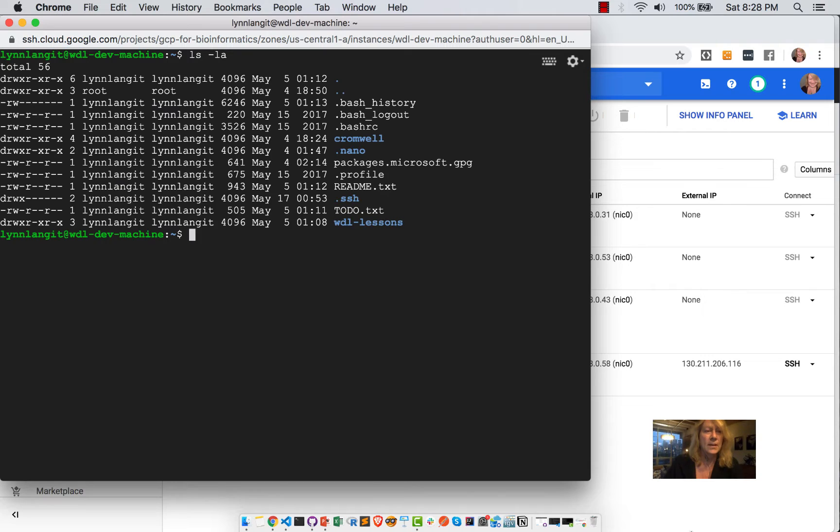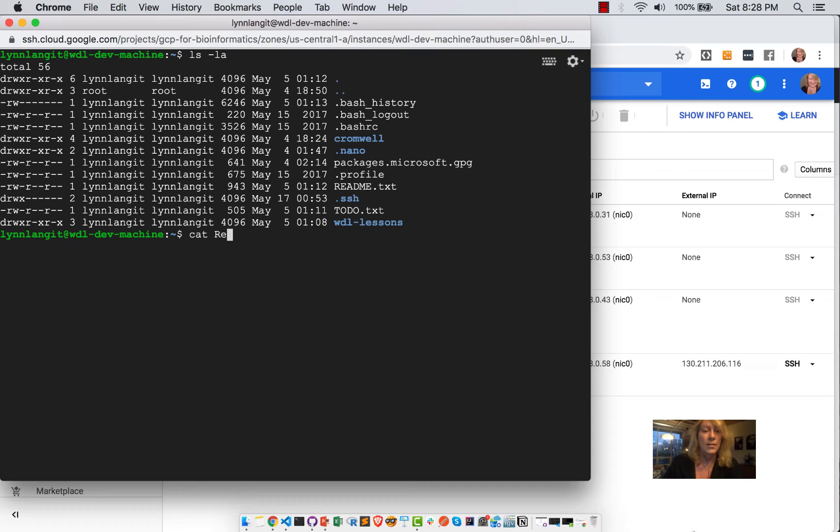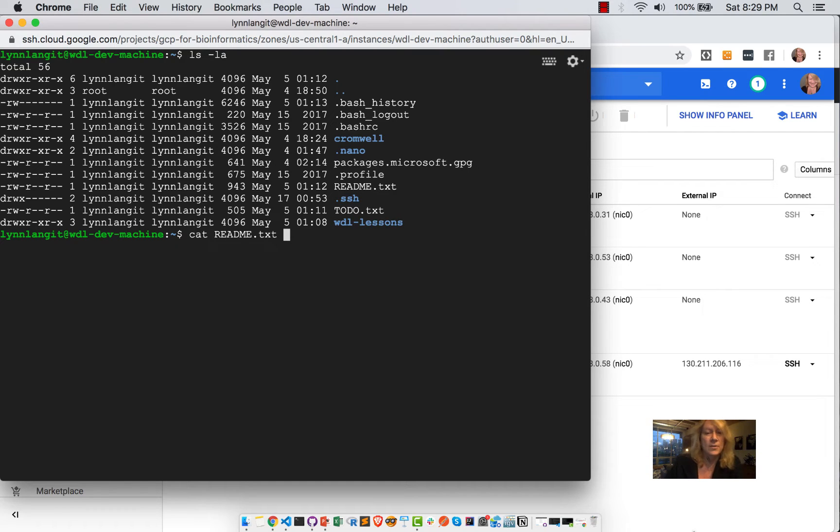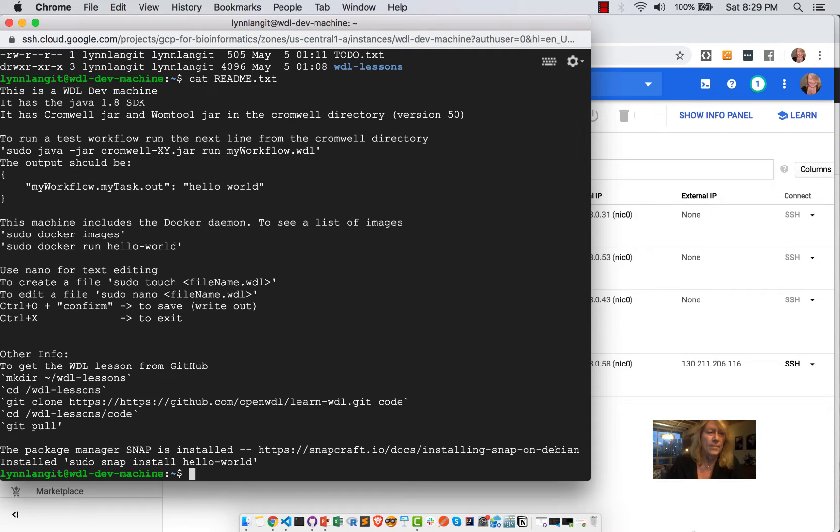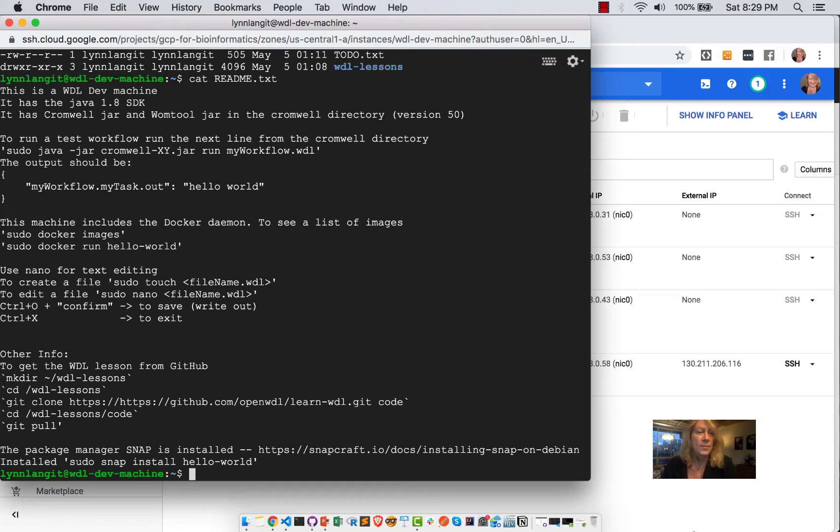And in this particular machine, I included a README so that I could quickly just get up and running. Notice I have a directory called Cromwell that I've created. And I've put the instructions here, which I'll also put inside of the repo.